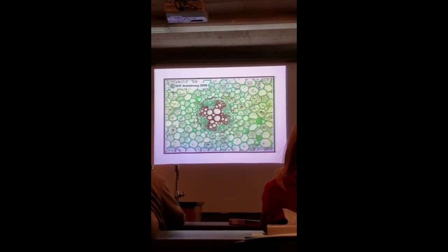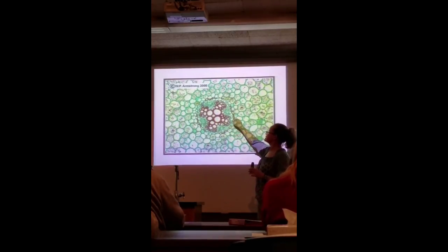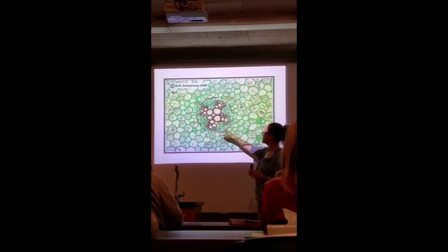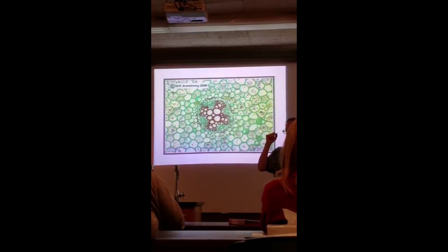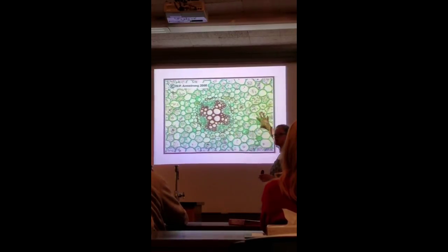The specific tissue that we have here is what? Making the cross is the xylem. Between the arms of the cross, we have phloem. This is the endodermis. Okay, and then just inside there's another layer. Does anybody remember what that's called? Pericycle. That's right. Does this one have a pith? No. It's missing. It just has vascular tissue in here.